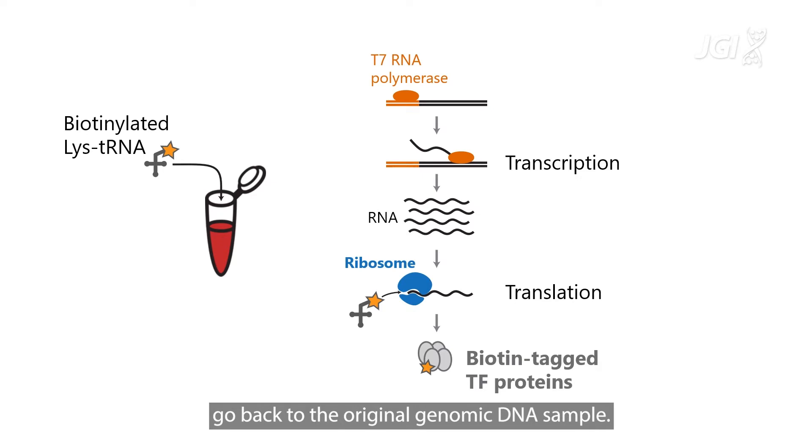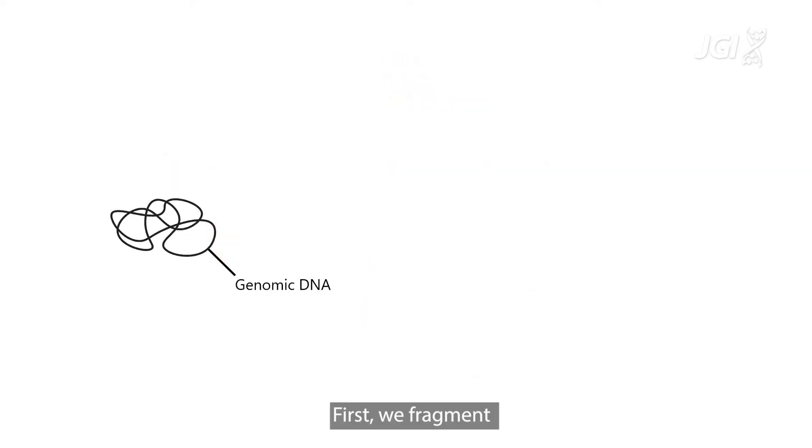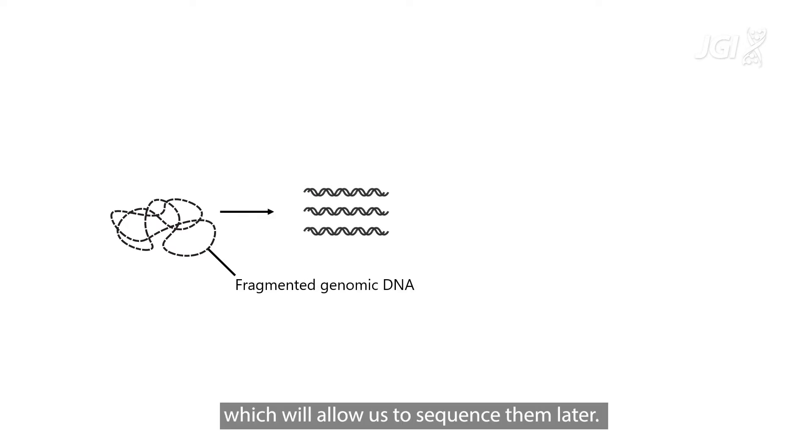Now in the meantime, let's go back to the original genomic DNA sample. First, we fragment the genomic DNA into short pieces. We ligate adapters to these fragments, which will allow us to sequence them later.